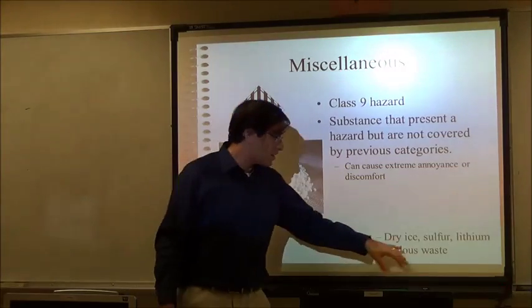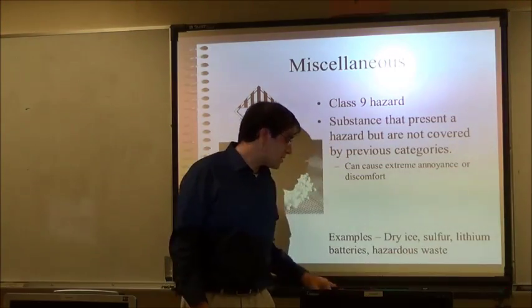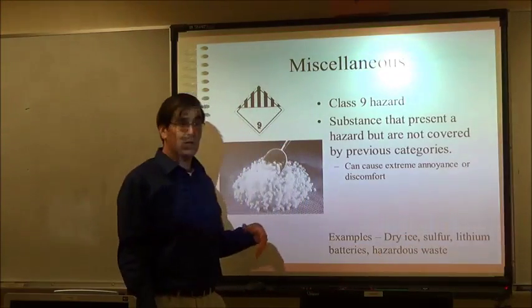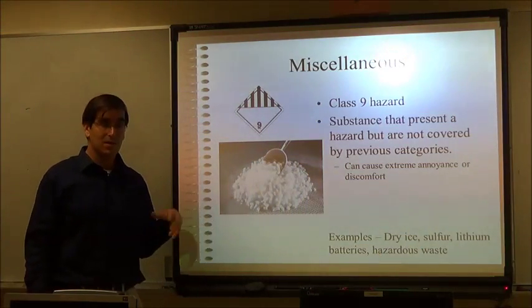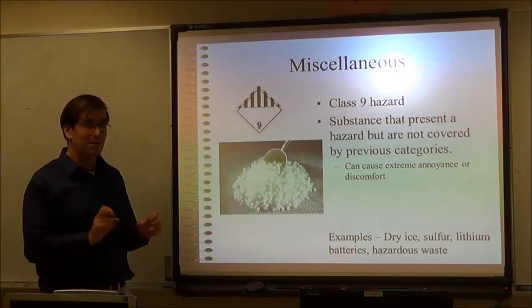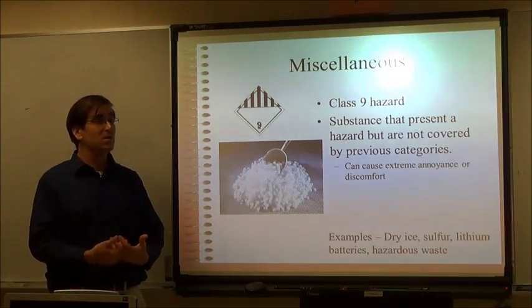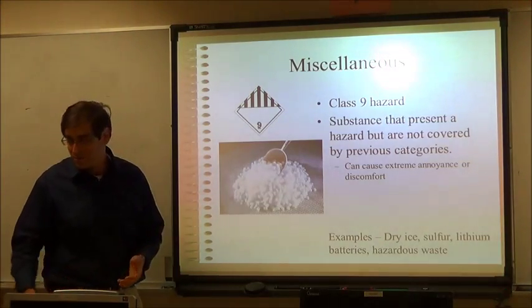Other things are stuff like sulfur. The lithium that's found in batteries and hazardous waste, technically, can fall under the category of miscellaneous. Some things we would consider hazard or bio-waste, but it's not necessarily poisonous. You still don't want to expose yourself to it.